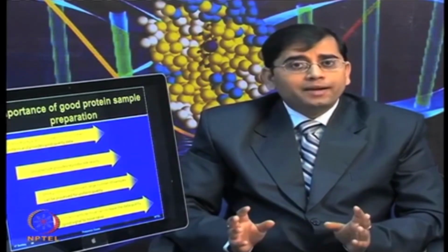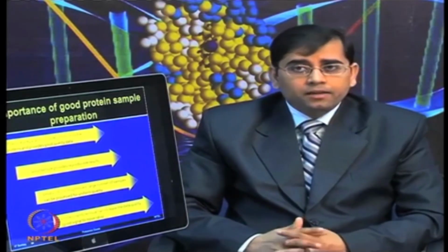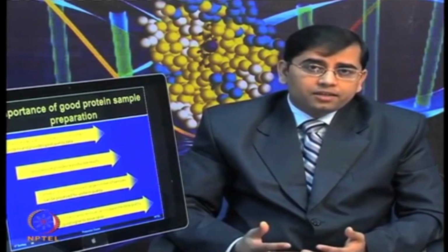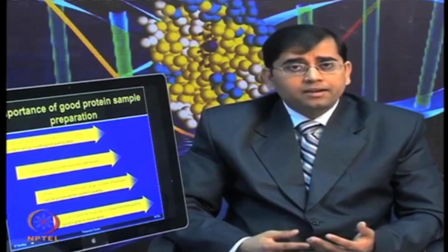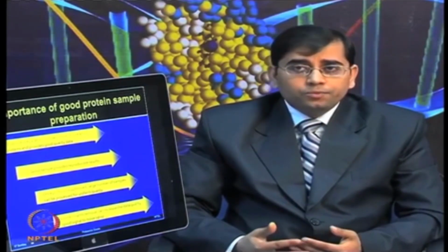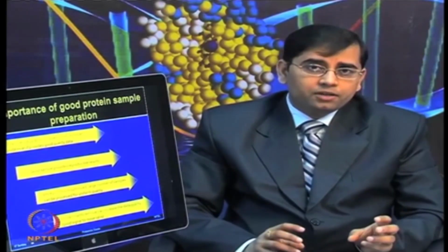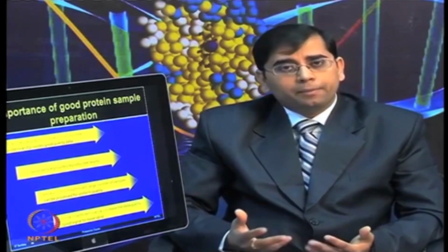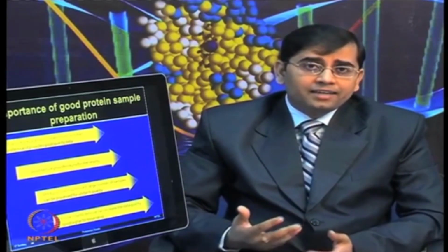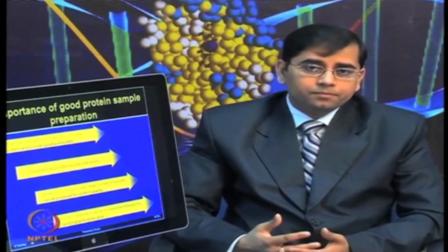Once you have optimized a protein extraction protocol, then you can apply the same protocol for large studies. For example, if you are performing a clinical trial study on 200 patients, once you have optimized the protocol with a small population, then the same protocol can be applied for a large number of samples. So, that is going to ensure the success of the clinical studies.